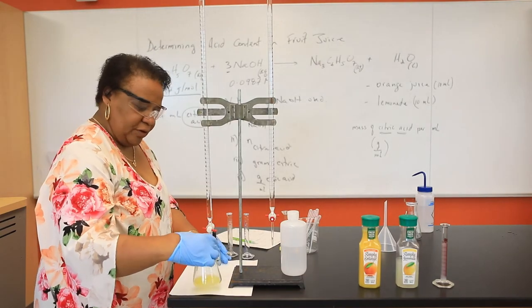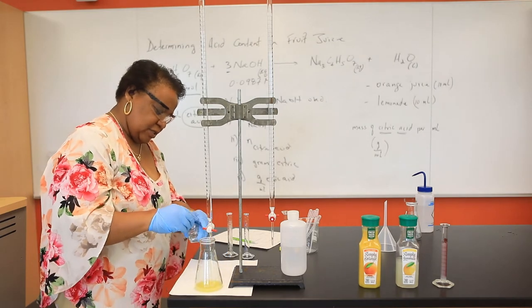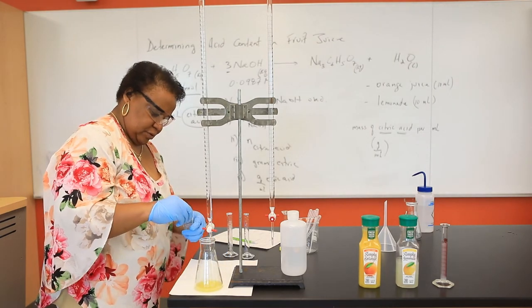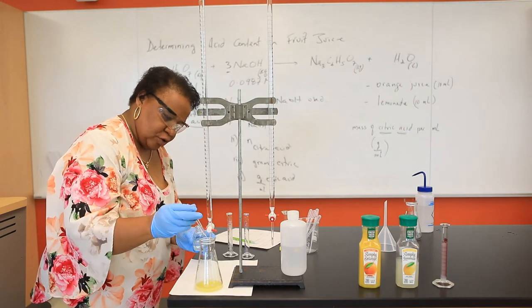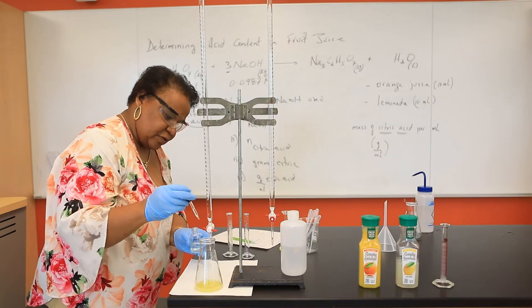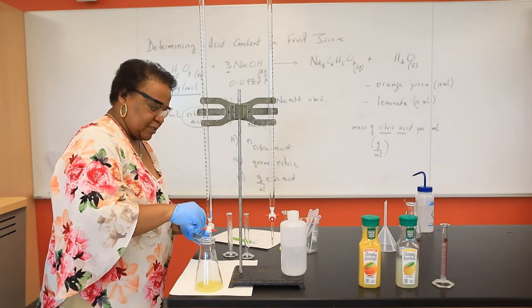After diluting with 10 mLs of water, I'm going to go ahead and add a few drops of our indicator, phenolphthalein - two to three drops of that indicator.